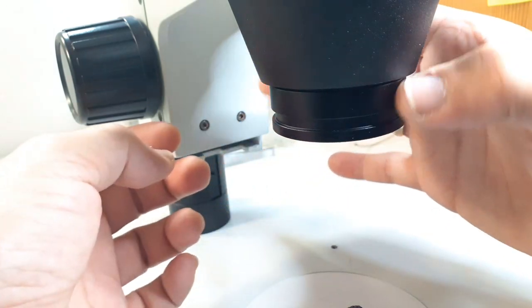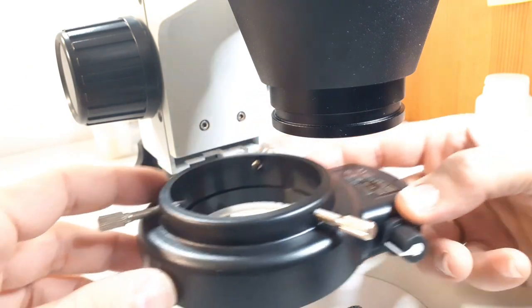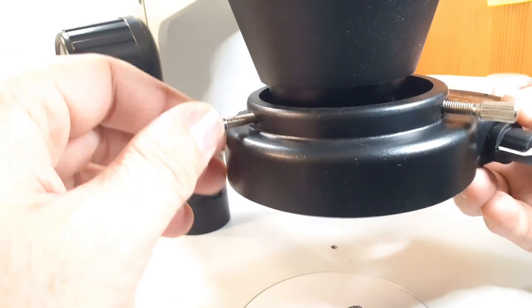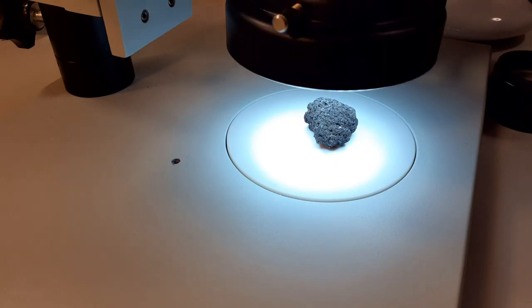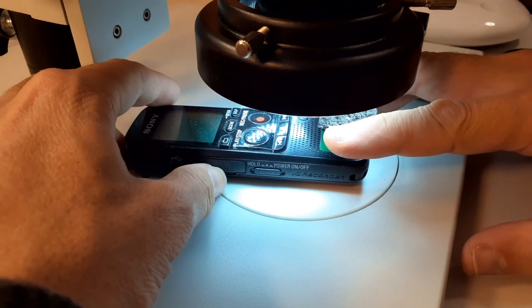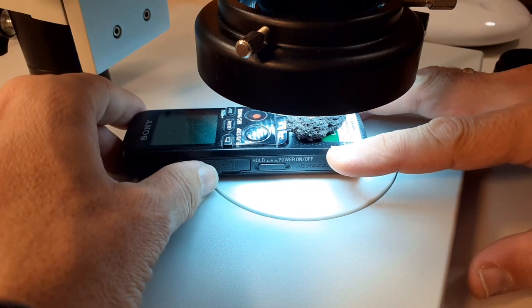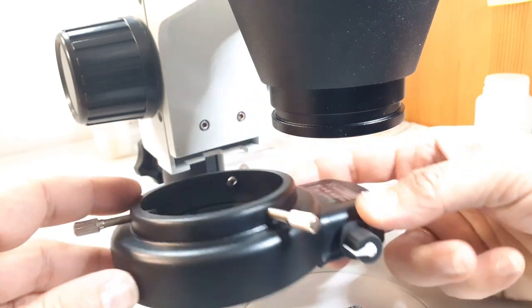I'm going to attach the 2x Barlow beneath my stereo microscope. This doubles the overall magnification but also significantly reduces the so-called working distance, so I have to move quite close. In my case I could not even move close enough to the volcanic rock I'm looking at, so I had to raise the specimen up on my little MP3 recorder to get it in focus. Because the distance was so close, I also had to attach a ring light — otherwise the ambient light of the room would not have been sufficient to illuminate the specimen.